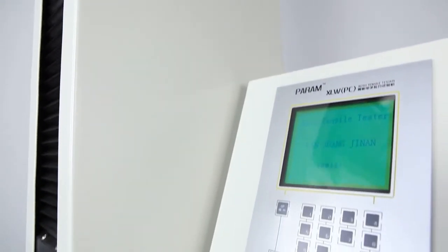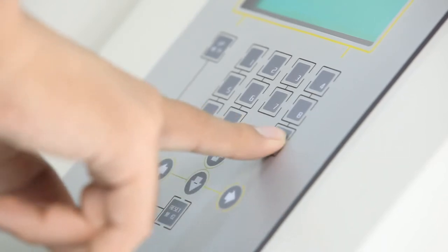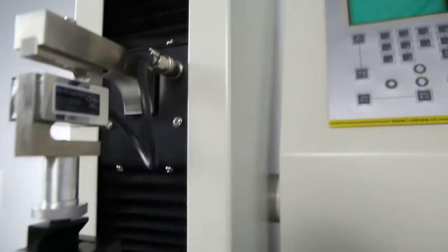The LCD display and PVC operation panel integrated with the tester allow users to operate tests without computers and improve the operational flexibility and adaptability.